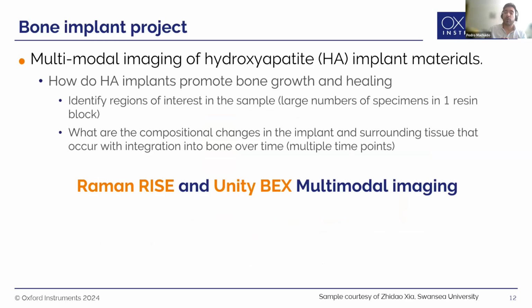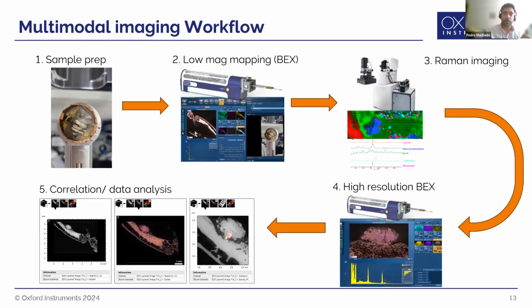For the bone implant project, we wanted to look at these hydroxyapatite implants and see whether they are promoting bone growth and healing. What's going on around the implant? How does the bone and implant interface look? So we thought, okay, we need a workflow that will allow us to look at this. So we decided to go for this Raman RISE using our BEX multimodal imaging.